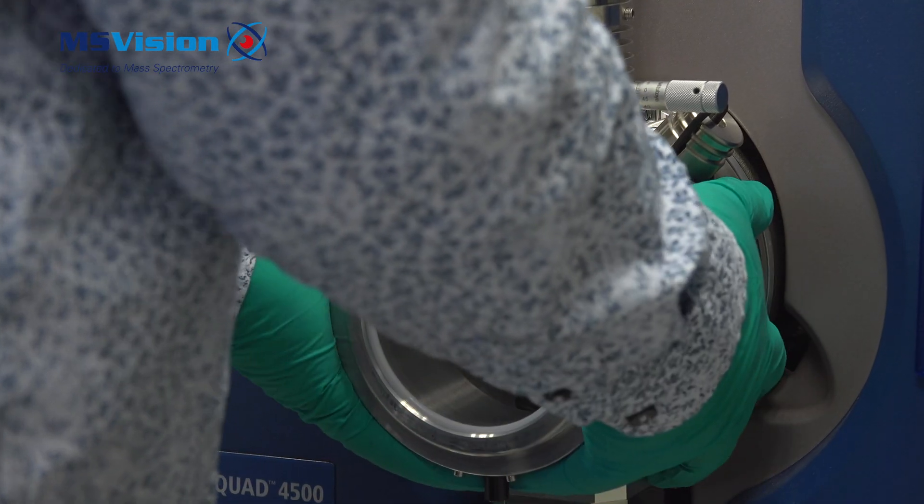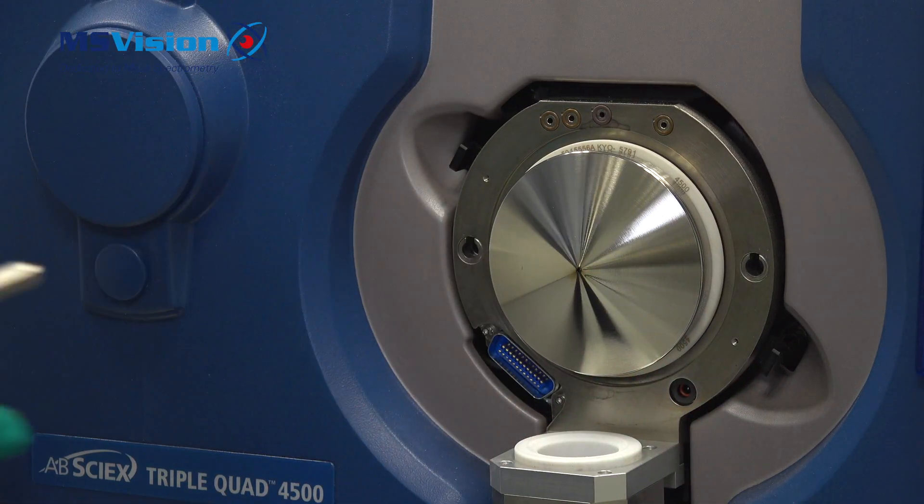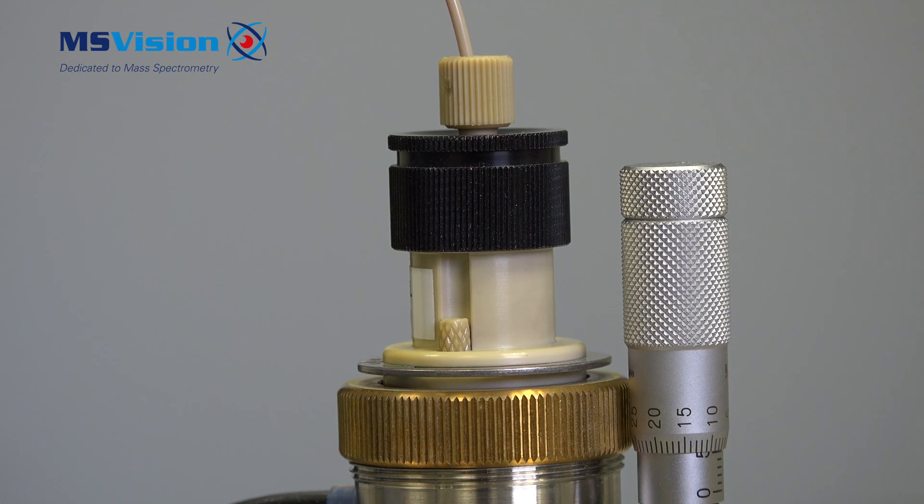To change the capillary, first remove the source by moving the two black levers down and pulling the source out and away from the system.